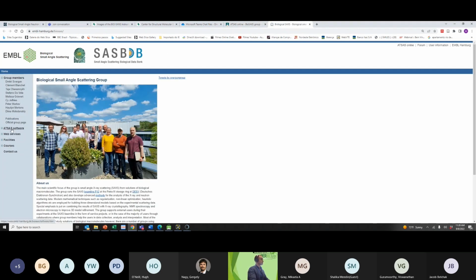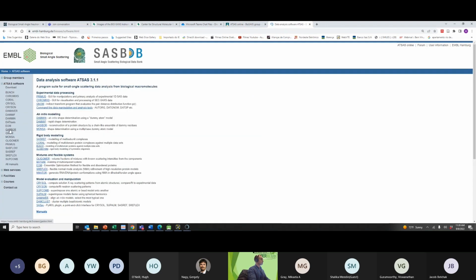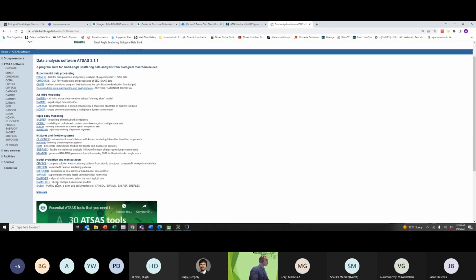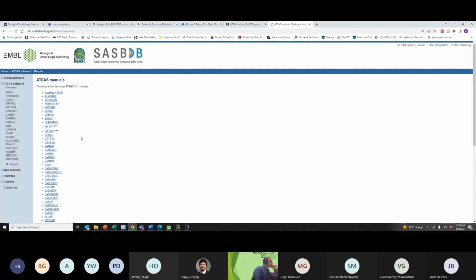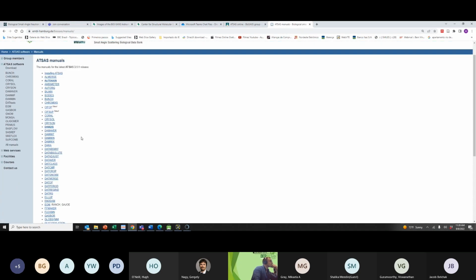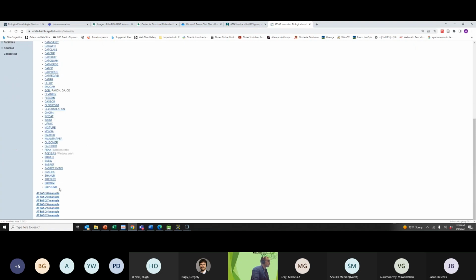So you have the ATSAS software here on the ATSAS page, and you can look at what software you are using. Let me see what is the one. Supcomb.